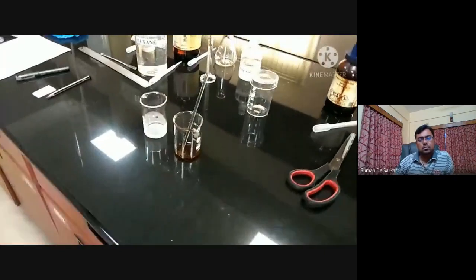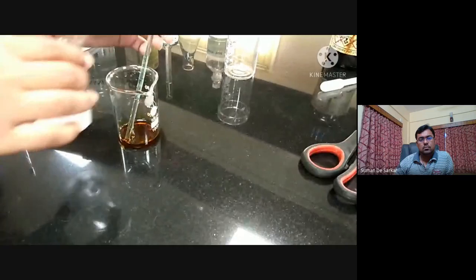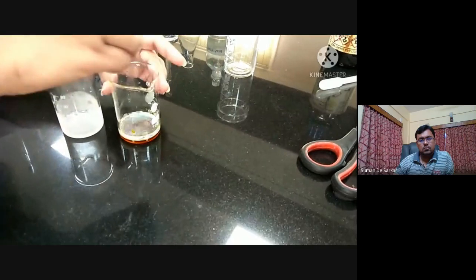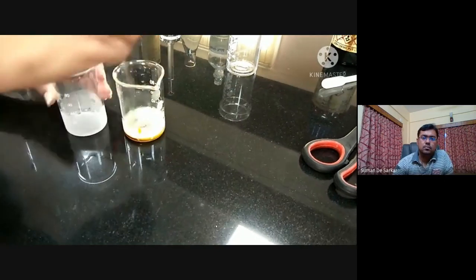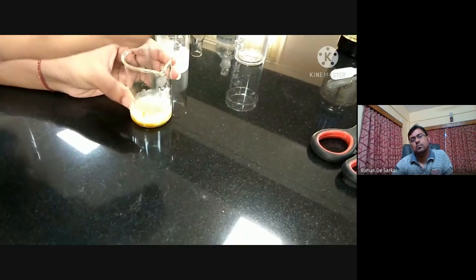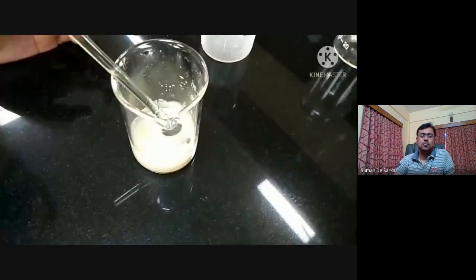You have taken it out. Now to the reaction mixture, we need to add the cold water. Adding the cold water. Oh, precipitate is coming out, with the whole amount of water. Continue stirring. Nice white precipitate of indole came out. You can see the color changed completely now. It's a milky white precipitate of indole.